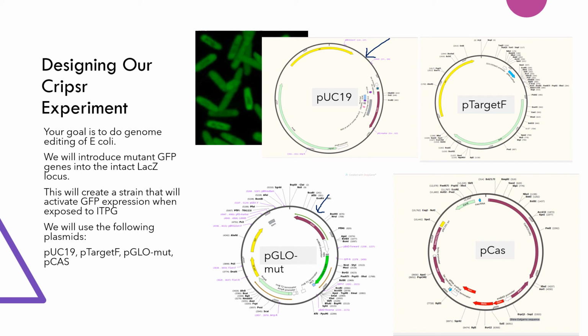Okay. So right in here, inside of pUC19 is the LacZ gene, and that is where we're cutting in E. coli, but it also is represented on this plasmid. And there's a spot right in the middle here where we picked for our guide RNA. And after we've cut open at that guide RNA, we want to do a repair where we use LacZ and we fuse GFP into the middle of it. Let me switch to green there for our GFP. There. So that's going to be our repair template.